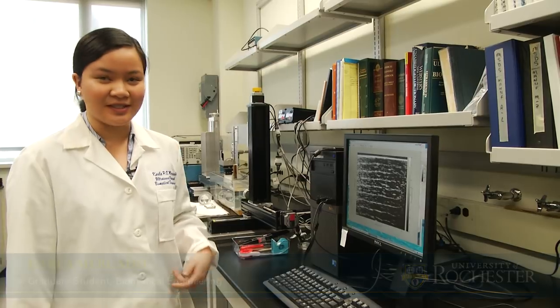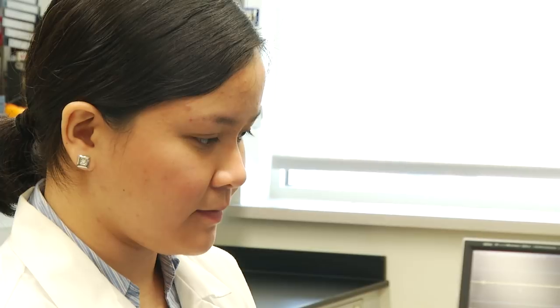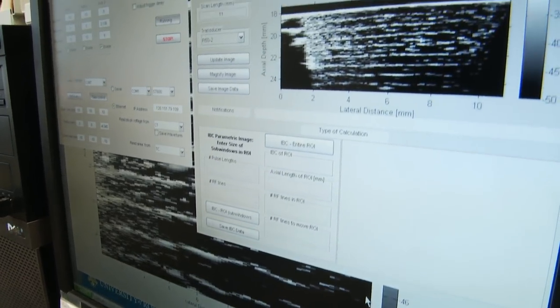So what we have here is the banded patterns that could be visualized using ultrasound. Tracking these cell concentrations gives us the capability to monitor cell migration and cell proliferation within these 3D engineered tissues.